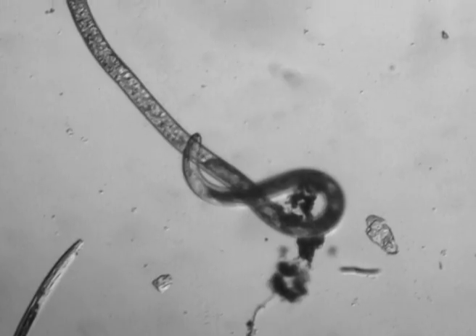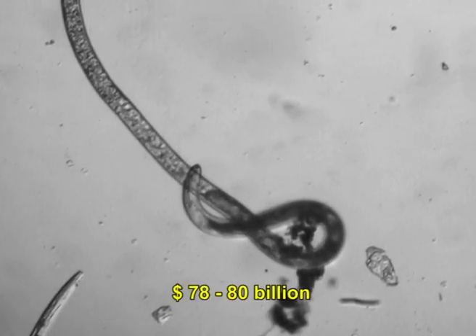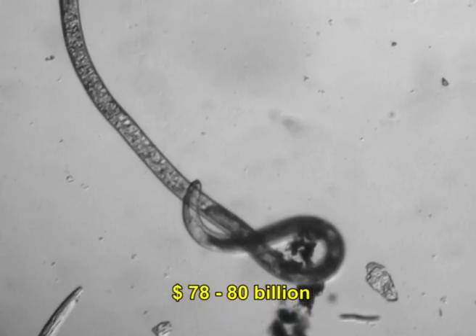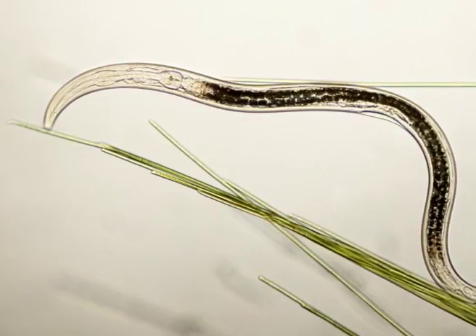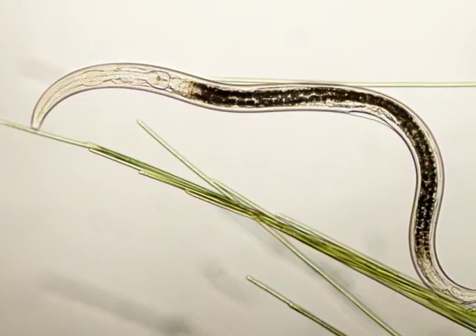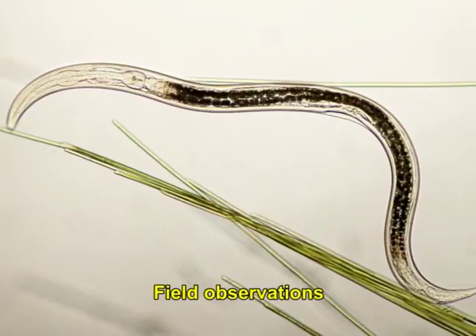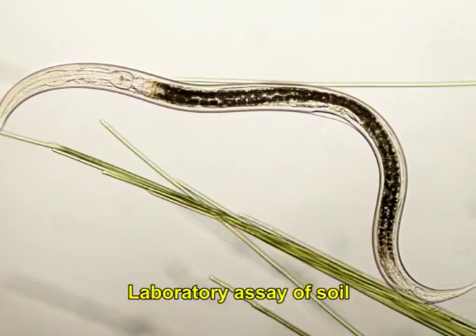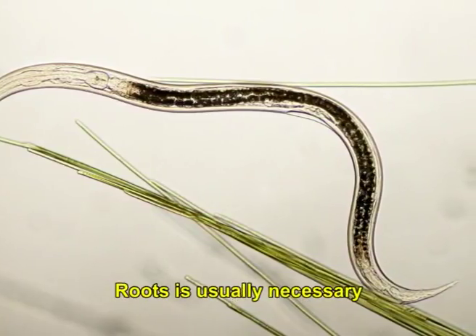Globally, the annual yield loss resulting from nematodes amounts to about $78 to $80 billion. Over a period of time, some nematode symptoms could be accurately diagnosed in the field. But in order to confirm field observation, laboratory assay of soil and root is usually necessary.